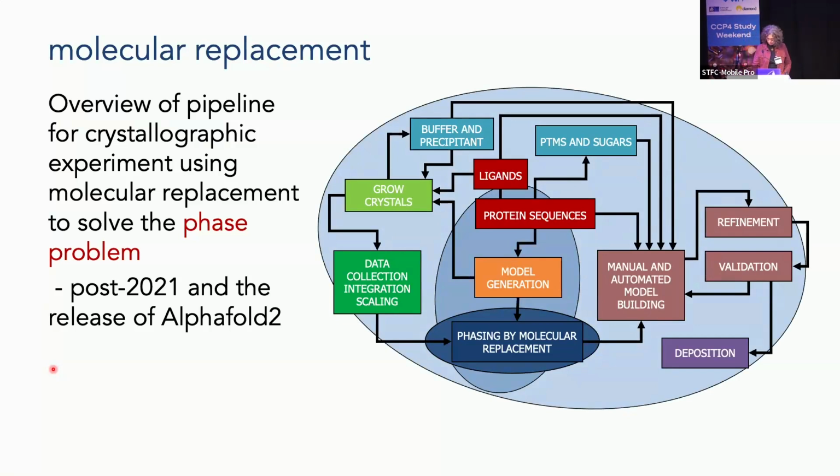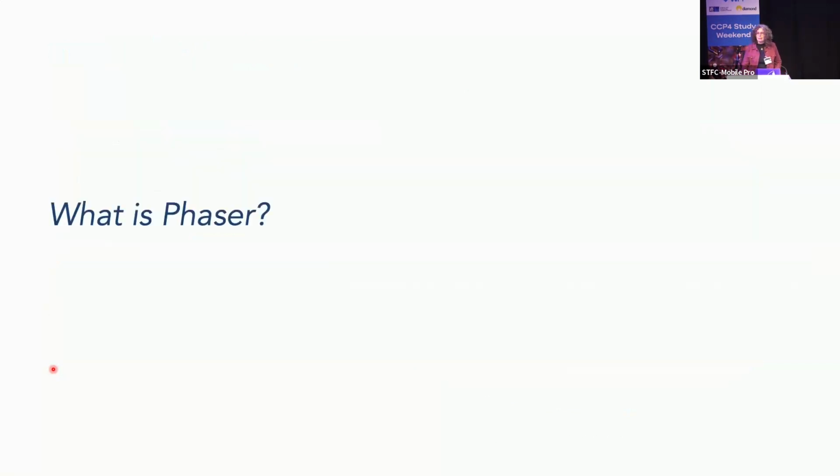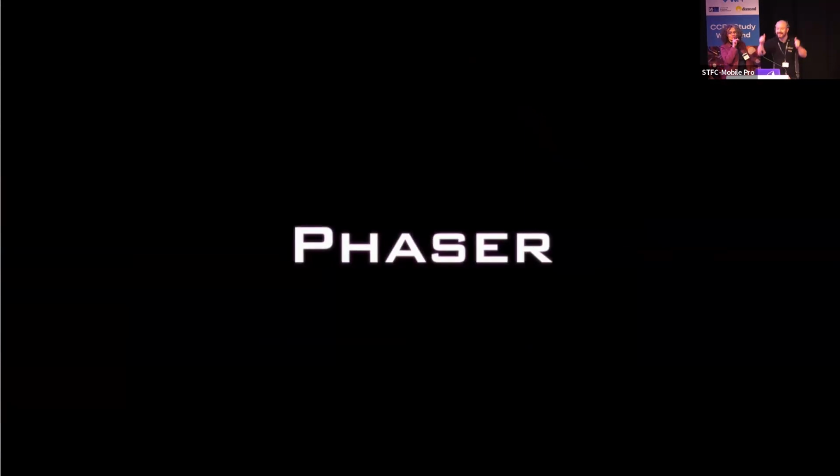I'm going to concentrate on this core engine, and I'm going to talk about molecular replacement with a program called Phaser. Now, I know people here come from many different backgrounds, and many people are coming into crystallography. So I'm going to introduce it. I've got a fantastic title from Dorothy, so I'm running with the theme of, there we go.